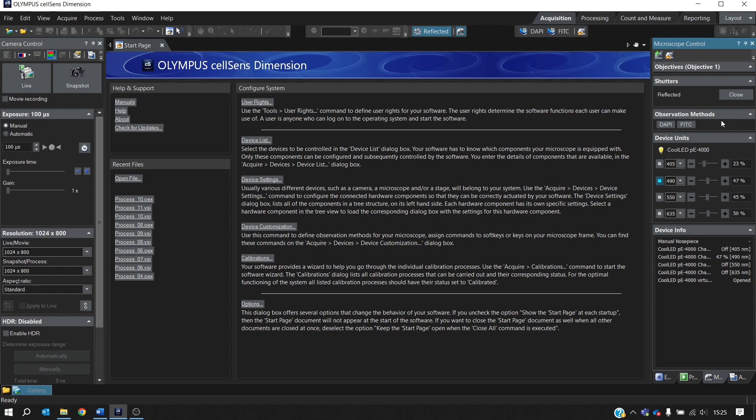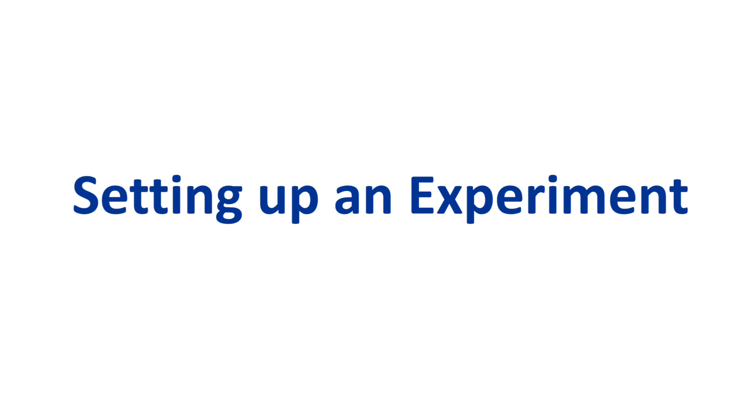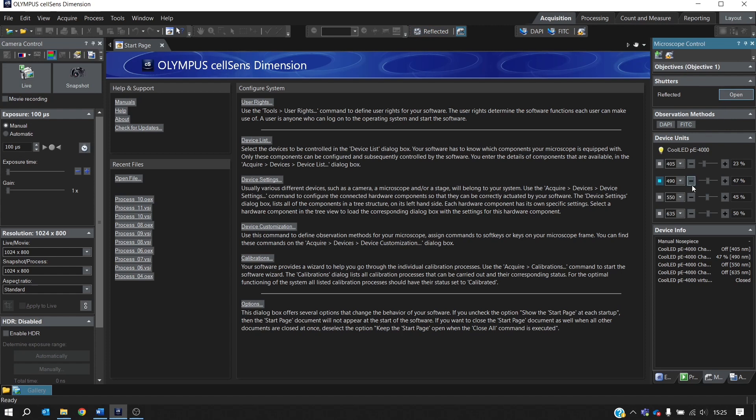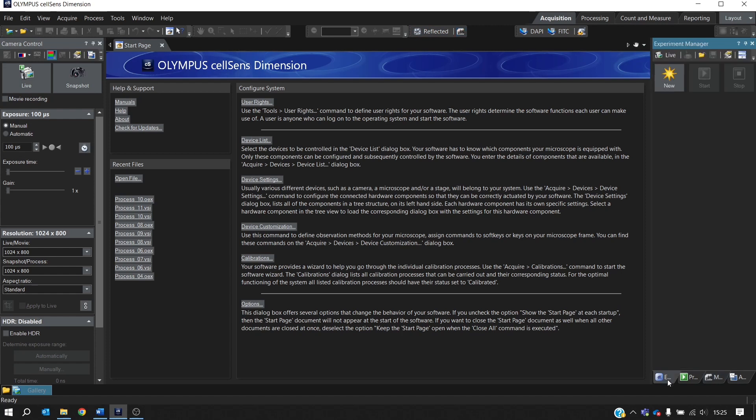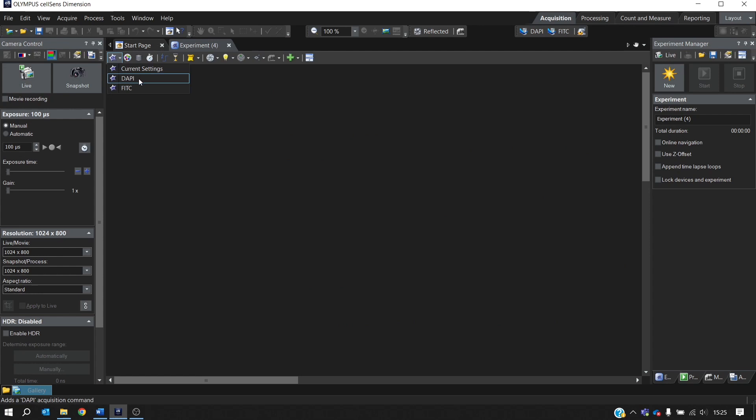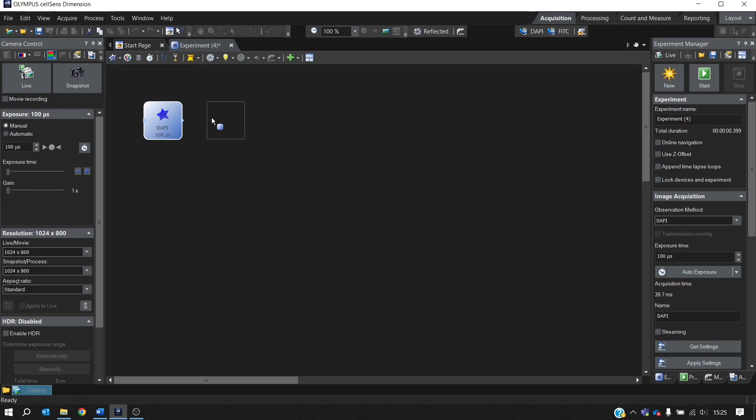So the next step is to set up an experiment. And to do this, we go down to the Experiment Manager tab. And we will create a new experiment. On this drop-down menu here, you can see your observation methods. So we'll select DAPI and FITC. You can optimize for settings here.